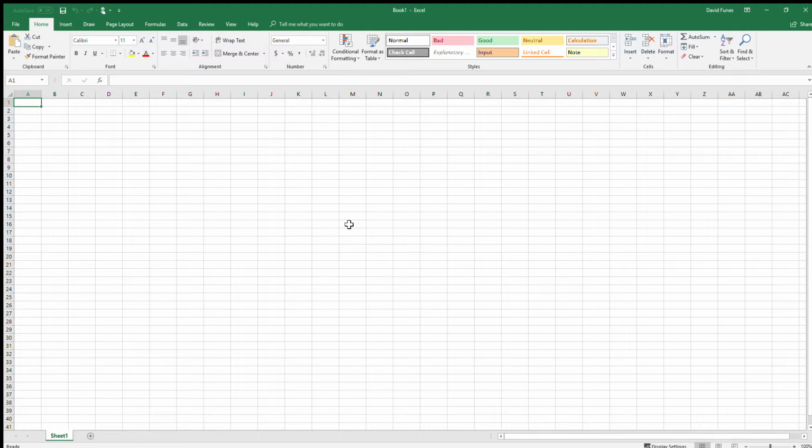This is to help you with your phosphate lab and to do your data analysis correctly, make sure you got everything done correctly. That way you can write your lab report. You can include this curve we're going to include there in the results section. So let's just go ahead and get started.